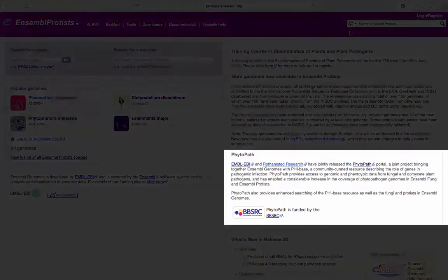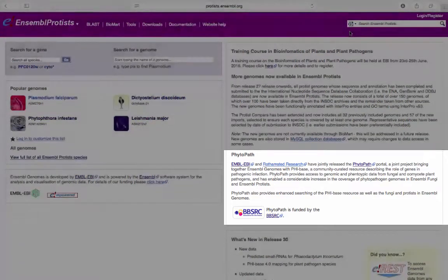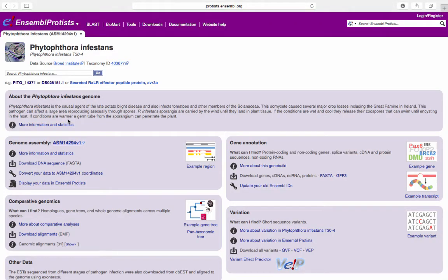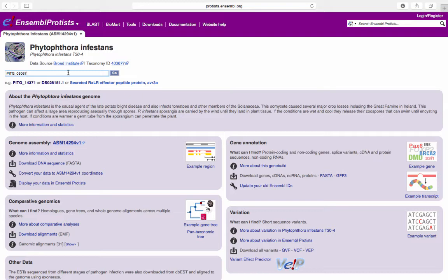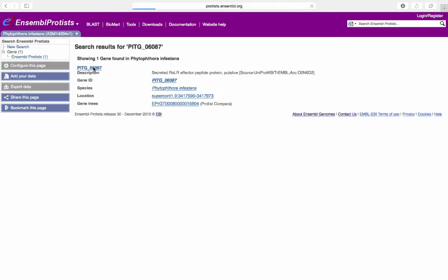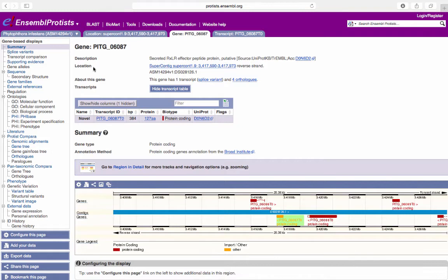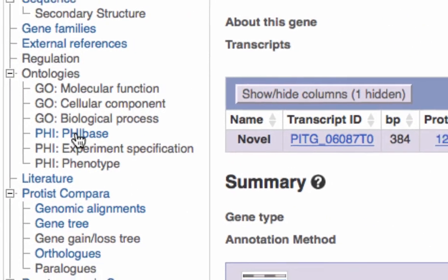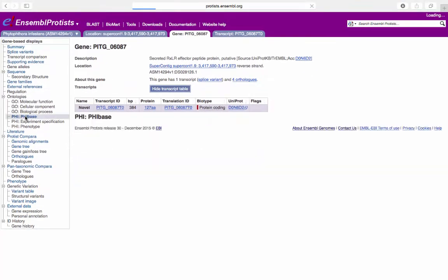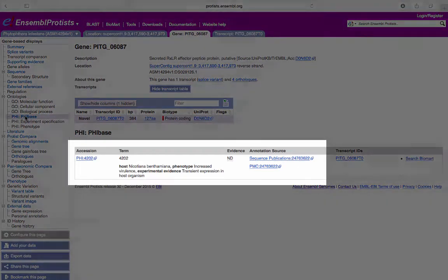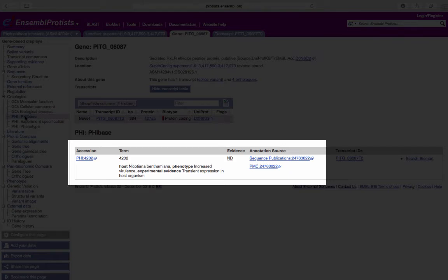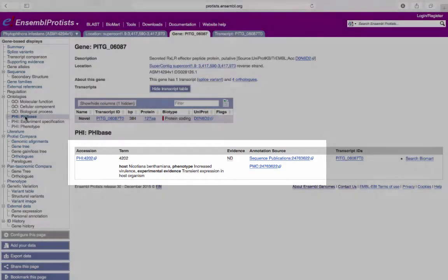Here. You can also access the PHI-base identifiers for individual genes. Click on the PhytoPath in Phytophthora infestans thumbnail. Search for the PITG underscore 06087 gene. Click Go. Click the link. From the menu on the left-hand side, click the PHI-base Identifier from the Ontology submenu. Here, you can find the PHI-base accession terms as well as links to the published annotation sources for the PITG underscore 06087 gene.